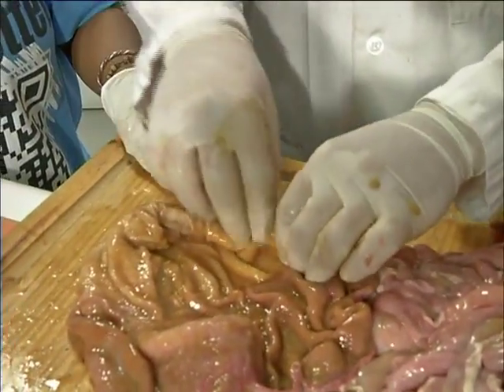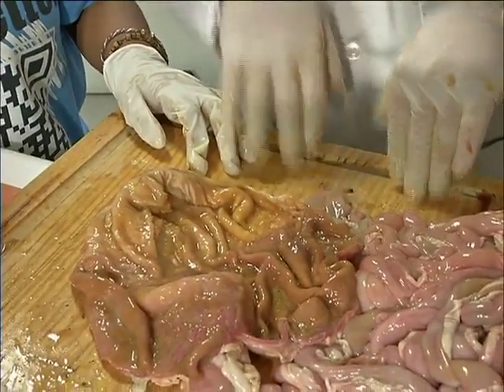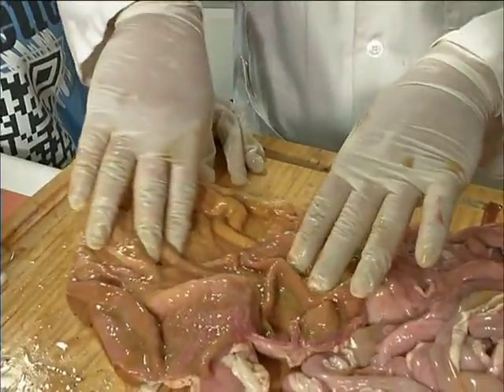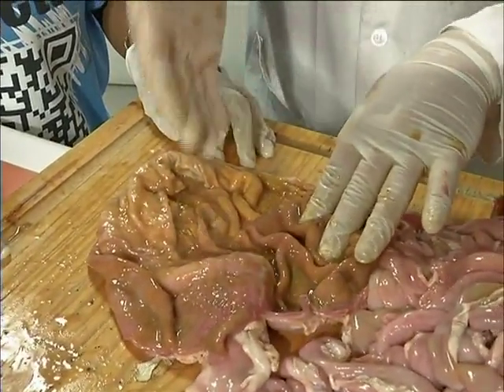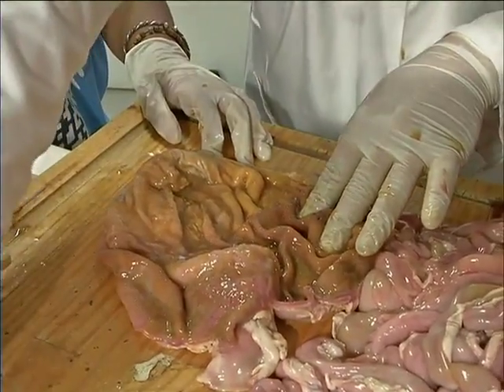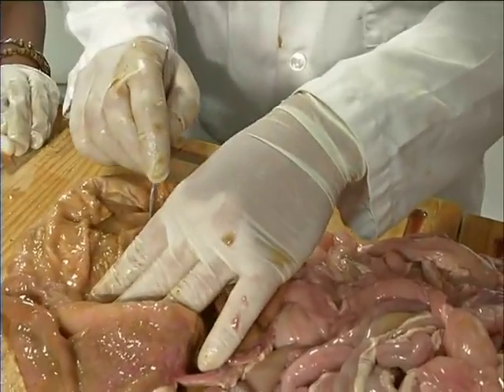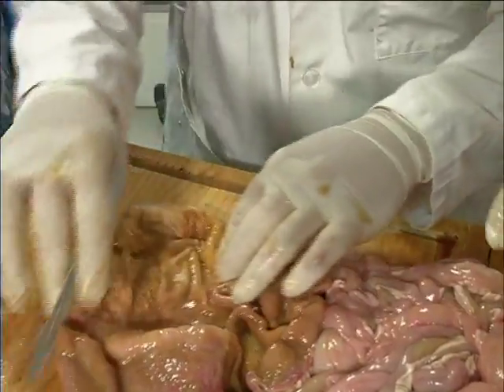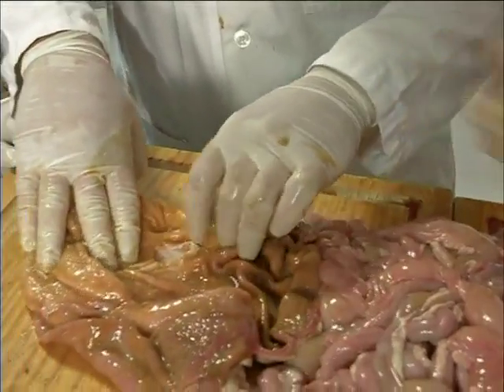Right? You've heard your mom and them talking about your stomach lining, hey? Can you remember stomach lining? Yes. Now that's a stomach lining. That stops the hydrochloric acid from eating the muscles, because what does hydrochloric acid do? It helps with the protein, right? Can you remember that? So what I'm going to do is cut it slightly in the middle. Is that why it's slimy? Yes. It's not stopping the digestion. It's slimy as you have no idea.